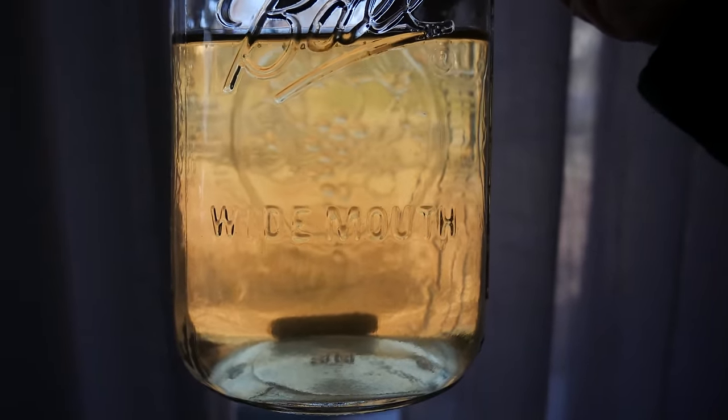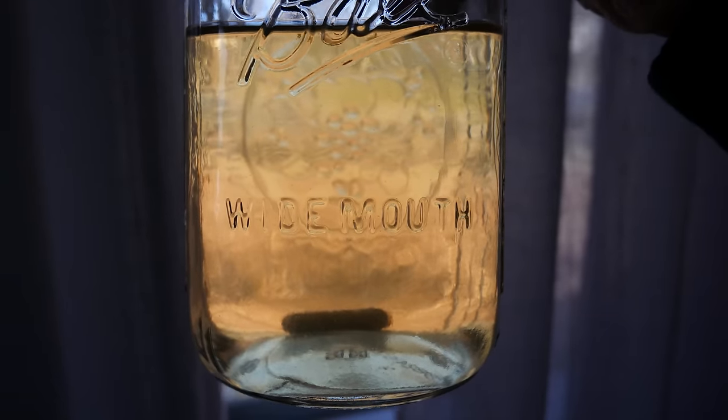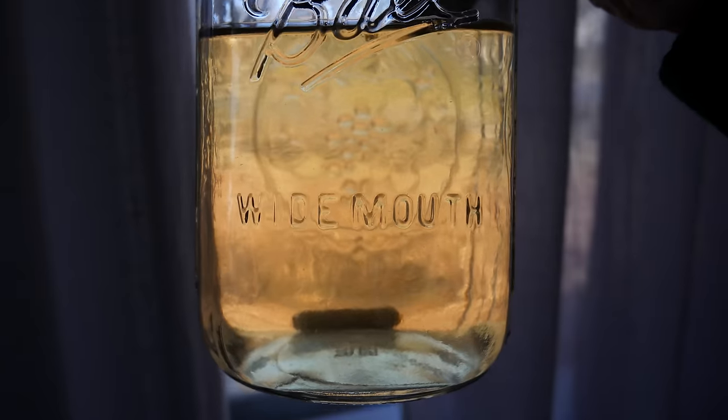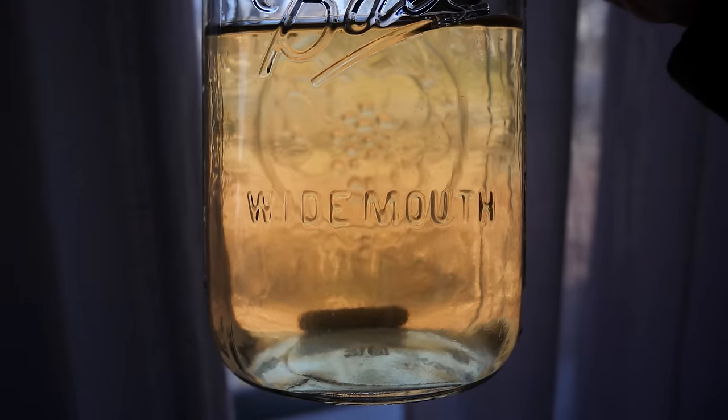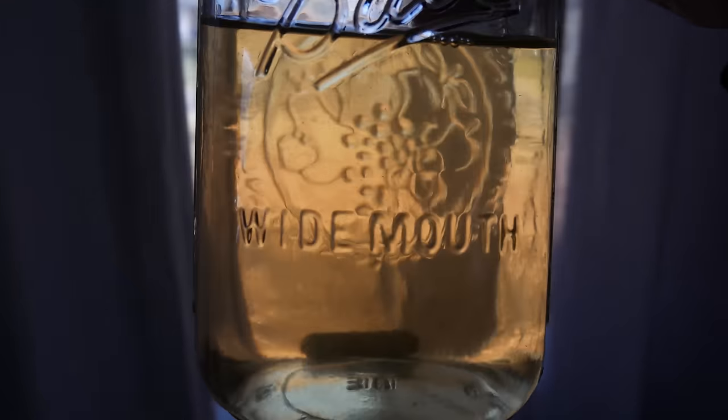I typically incubate my culture jars at room temperature, somewhere between 70 to 80 degrees Fahrenheit (21 to 28 degrees Celsius), for about 3 to 4 weeks. Once I notice growth has slowed down, I'll move the jars into my refrigerator for long-term storage. Liquid culture will last as long as 6 months, up to a year, or sometimes even longer.